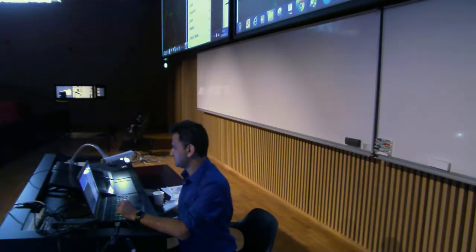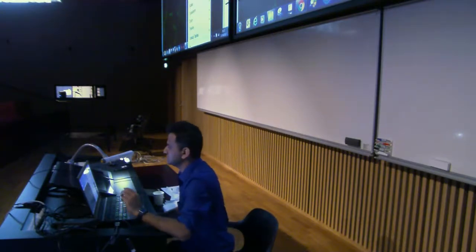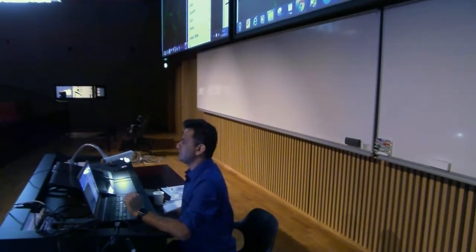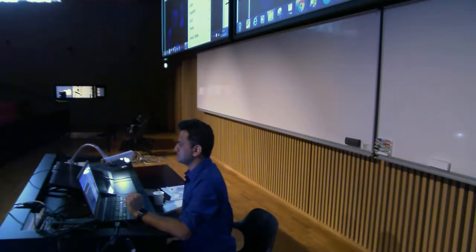I have to cover this, that there are different types of image available based on the pixel resolution or the pixel depth of the camera it has been taken with. So it can have 8-bit, meaning that 0 to 255 gray levels are possible for 1 pixel. 16-bit means that 0 to 65,000, 2 to the power 16, and 32-bit. You can also have RGB color, meaning just the 3 colors red, green, and blue. Okay, but I'm just making it RGB because that is important. So go to Image, Type, RGB Color.